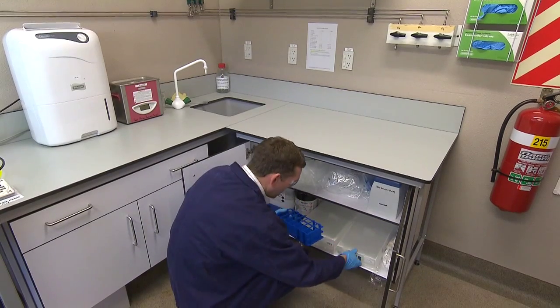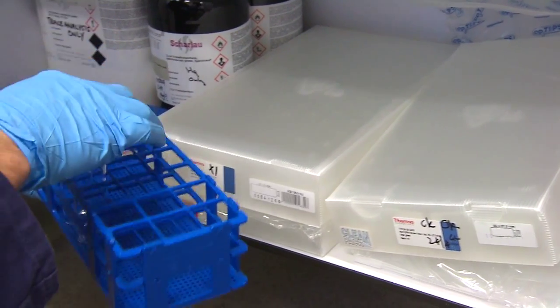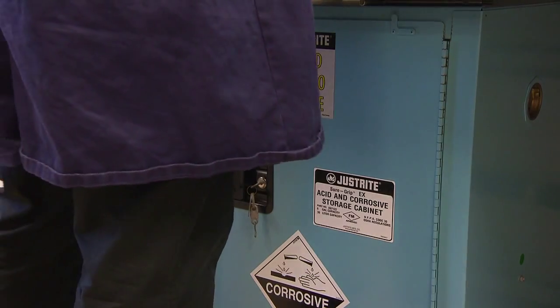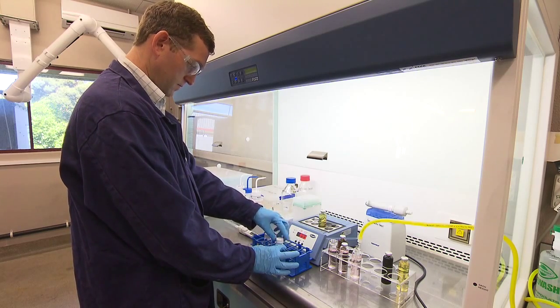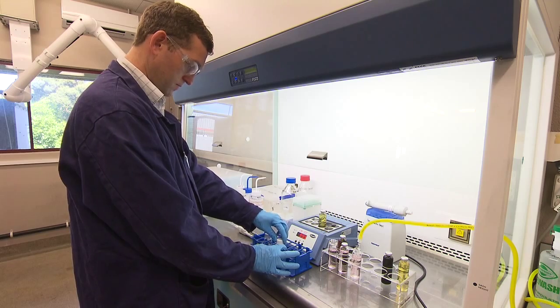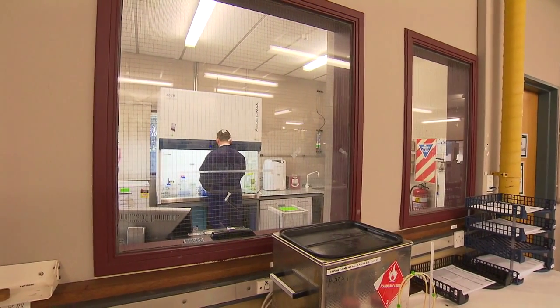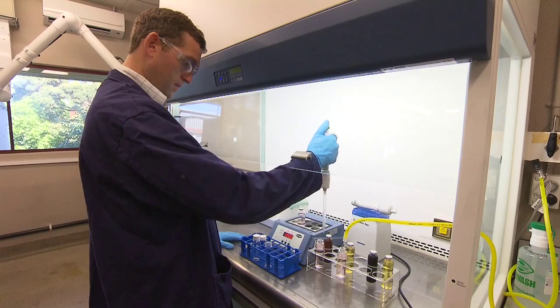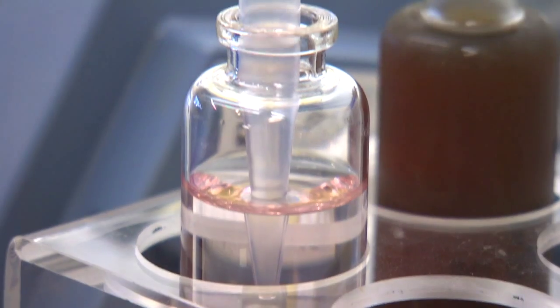Well, firstly, we need to maintain very high levels of cleanliness. We need to segregate all chemicals and consumables and samples. We check all consumables and reagents for contamination before use. And our custom-built trace analysis area is isolated from other testing areas of the lab. We also specifically train staff in ultra-trace working protocols.